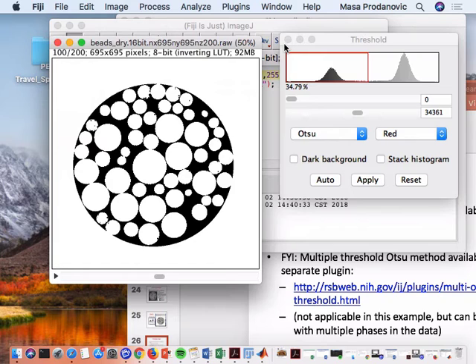For instance, if we didn't clear outside and ignore the outside, then in my case, black voxels would be black voxels, but in order to divide, what do I divide them by to get the porosity? The total number of voxels. So then it doesn't matter whether I'm counting the outside or not. Right? Another thing is to go to my make oval. I know what the radius of that cylinder is. I know how to calculate volume of the cylinder. Okay. So there are various ways you can do this.